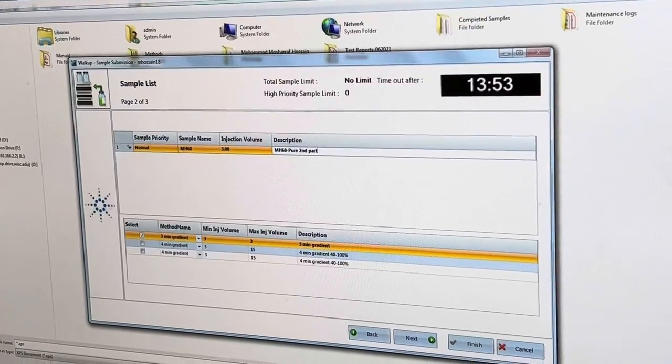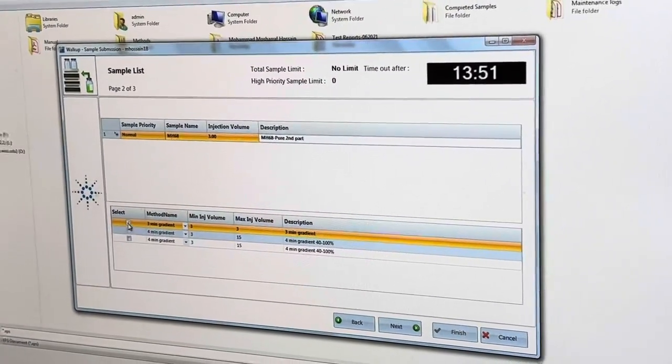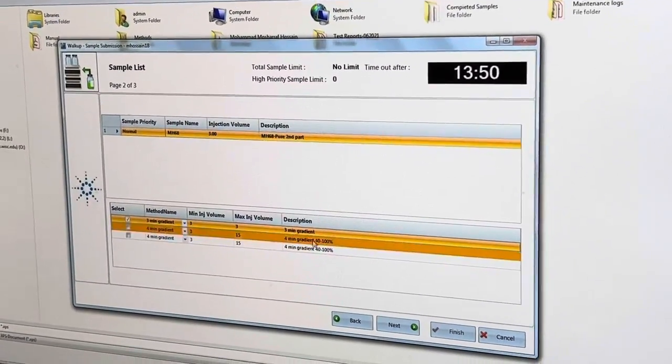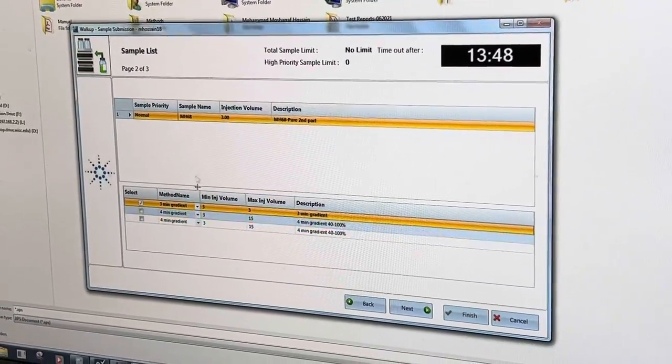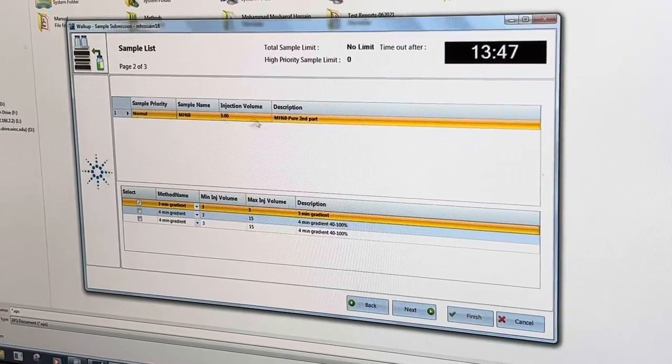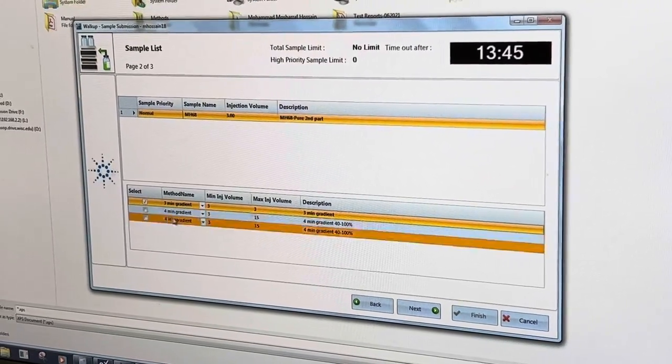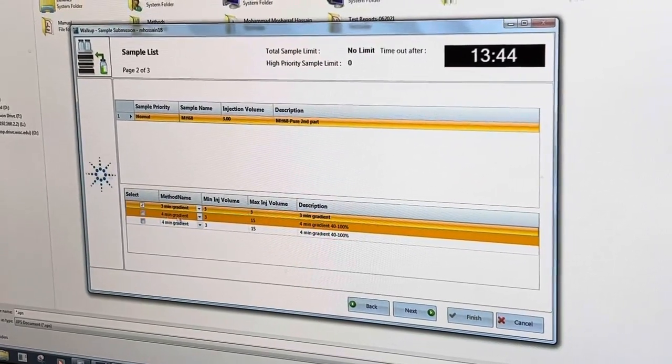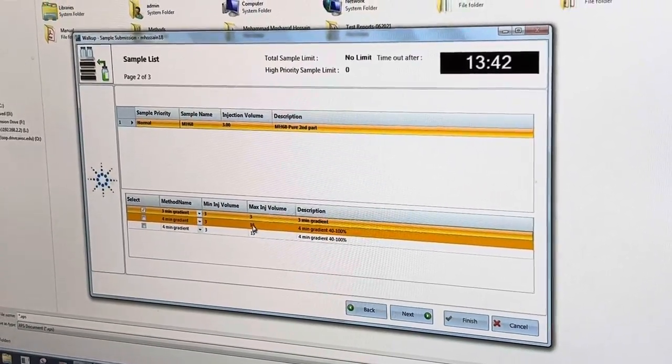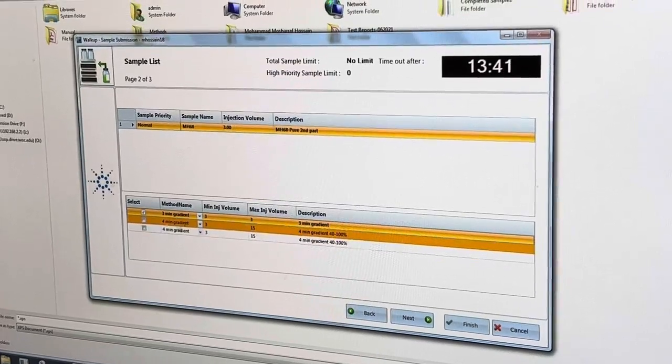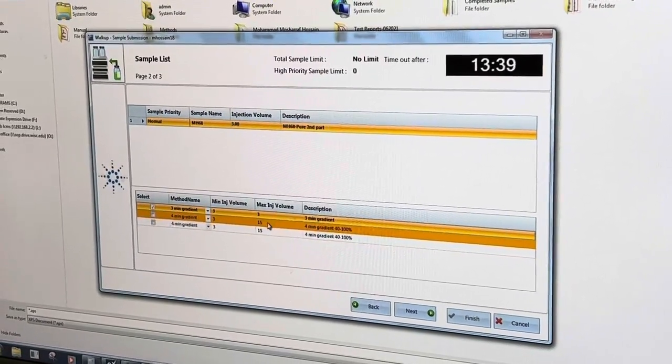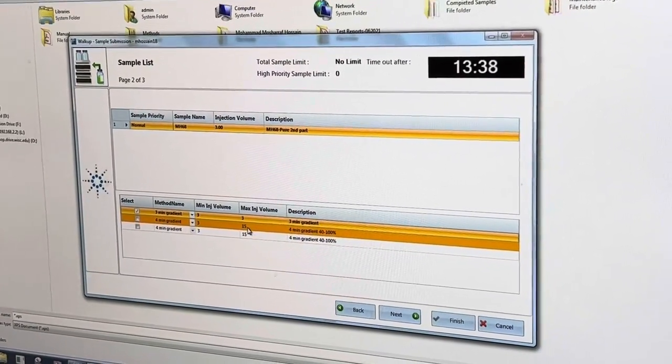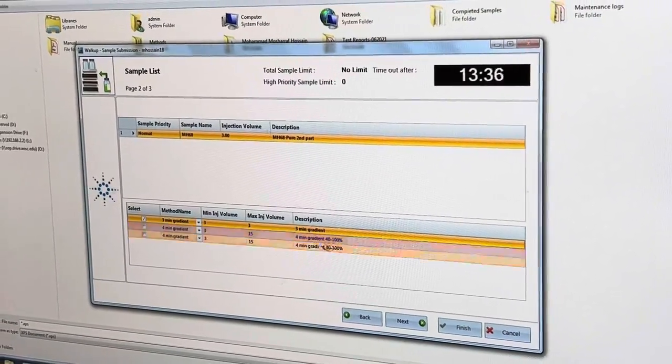There are like a couple of gradient options here so normally people do like three minute gradient. Also you have four minute gradient if you want to see here. So maximum injection volume is 15 microliter.